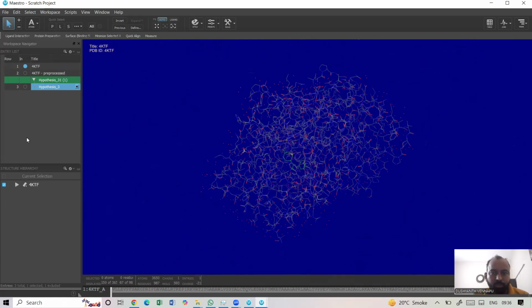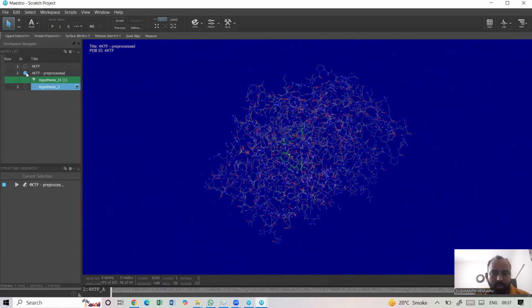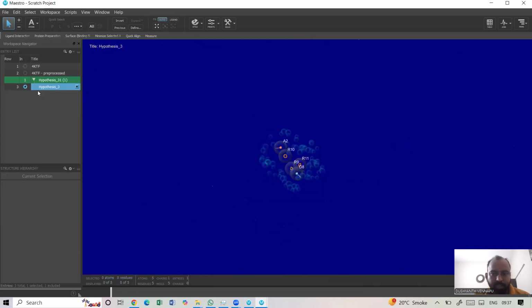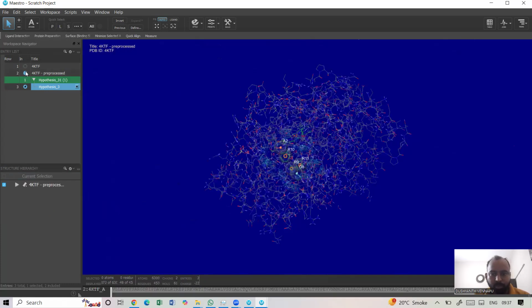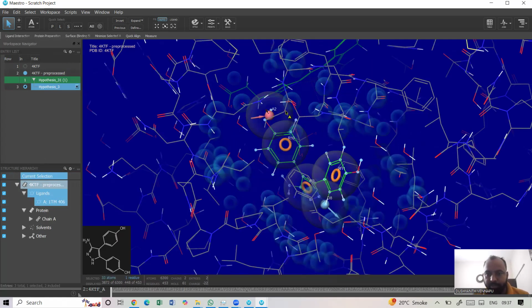So now once you prepare this, you just click onto the ligand and you click onto the pharmacophore. Just click your ligand and fix it in your space, and you click your hypothesis, fix it in that space, and you go for protein space and you just click your ligand, and it exactly fits into your database.